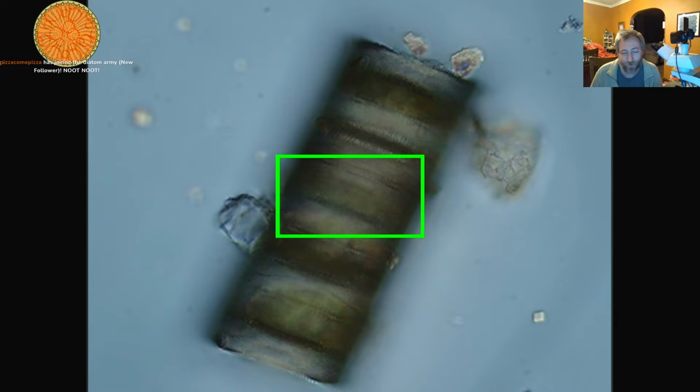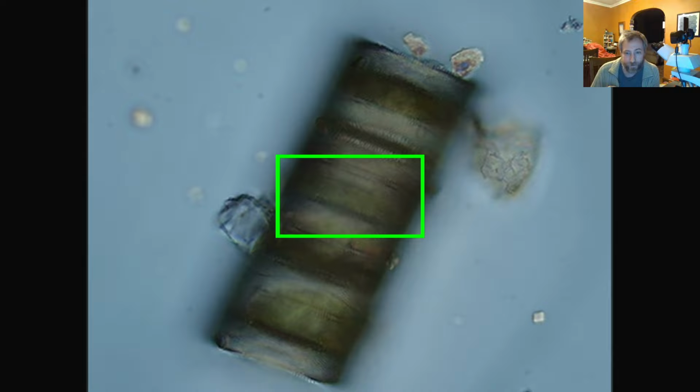And that's one of the reasons why I like studying diatoms so much. I know enough about their ecology to actually use them to tell, okay, this is a water sample. I know exactly what kind of environment these things represent. The group of them together basically gives me a family portrait of what kind of environment they have to come from. And you have to realize that it's an assemblage.